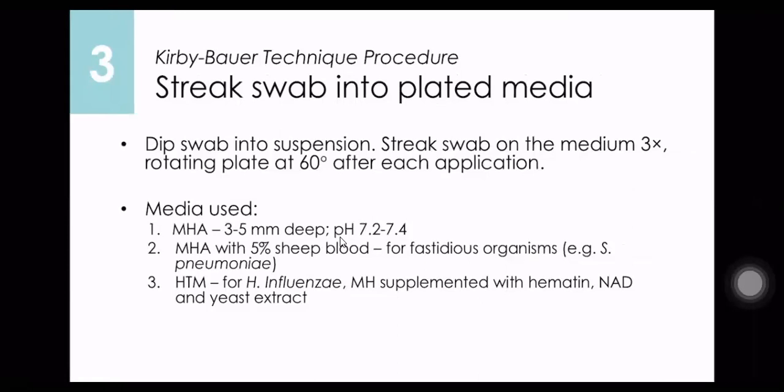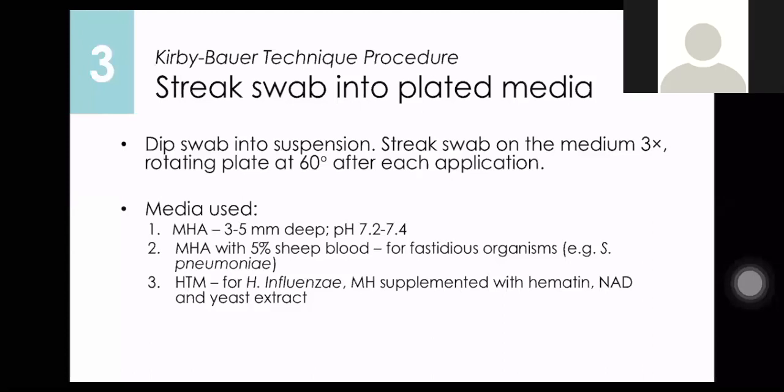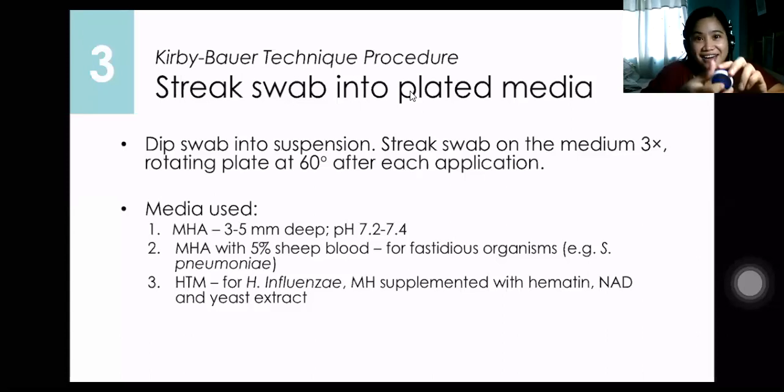So like for example, wala ko sang diri circular something. Okay. So, Vicks na lang. Like for example, hindi niya makita ang video. Okay. So, like for example, this is your agar. Diba? May pang-Vicks, diba? Mga oldies things. Okay. So, this is your MH plate or Mueller-Hinton agar plate.